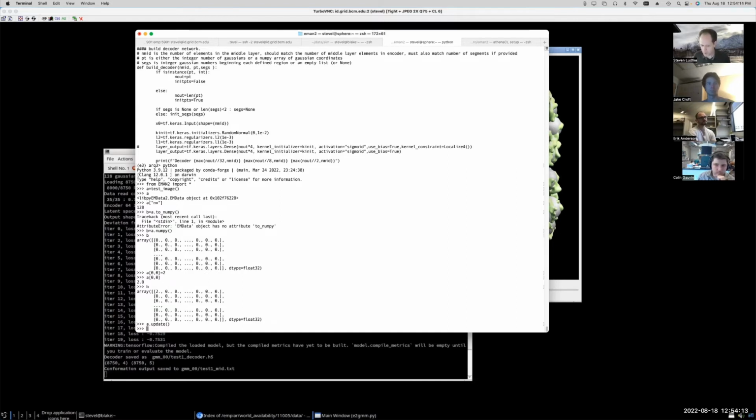And that's because when you create a TensorFlow tensor, very often that tensor is going to be stored in the memory on the graphics card on your computer, not in the main memory on the computer. And those two memory environments don't always talk to each other easily. So when you turn something into a TensorFlow tensor, TensorFlow will decide whether that object needs to live in system memory or whether it needs to live in other memory. So you can't just have these sort of joint objects.